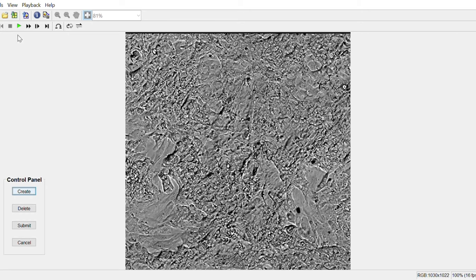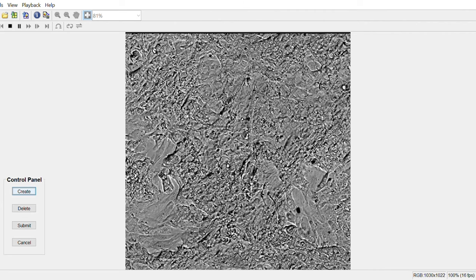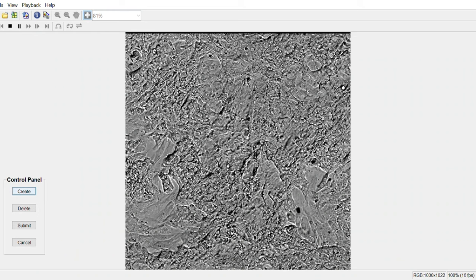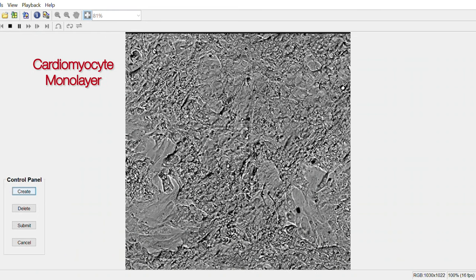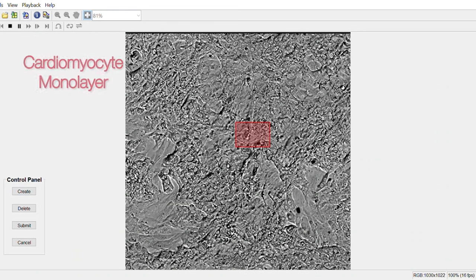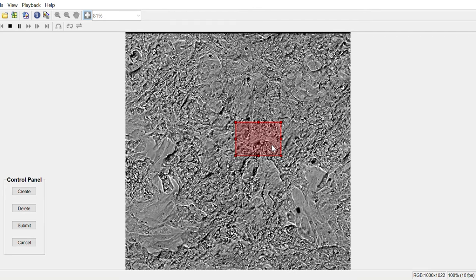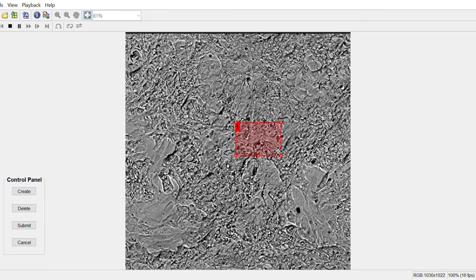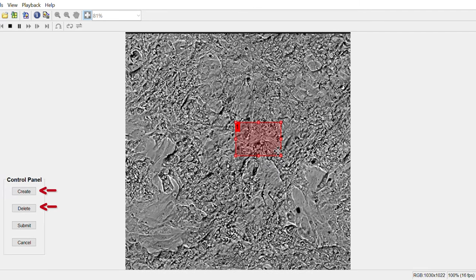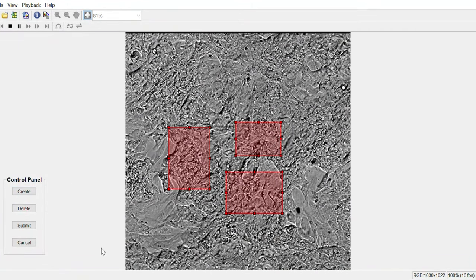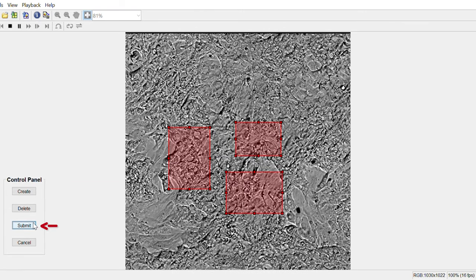For our analysis, I developed a function that would allow users to manually draw bounding boxes around cardiomyocyte contraction regions that they wanted to analyze. In the user interface, a cardiomyocyte monolayer video is displayed. As the video plays, you will see certain areas of the monolayer contracting over the duration of the video. The user interface contains buttons that allow the user to create or delete their selected bounding boxes. After the user has drawn all bounding boxes, they may press the submit button to continue with the contraction analysis.